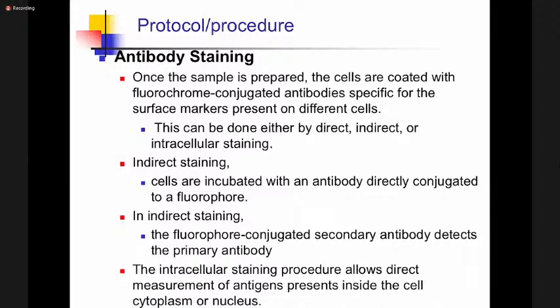And after that, you have these cells washed. They're washed to remove those which didn't bind to the antibody. And then you run them in the flow cytometer, which will now excite these cells according to different wavelengths of light, subjecting them to laser light. And from there, you can move to the analysis stage to check the proportion of cells which are scattered in the direction you would be interested in. We'll see that kind of scattering in a short while.